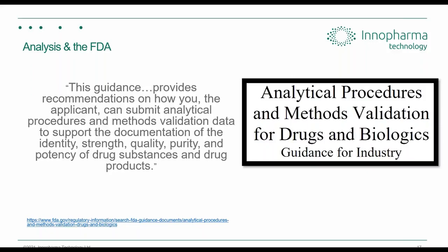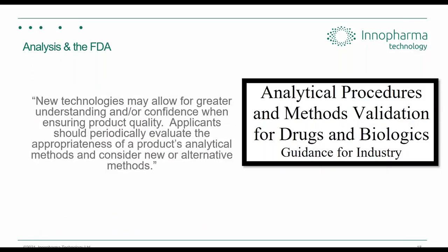Well, maybe over the life cycle of a product, new information and assessments might become available. You know, like Sieve's been around for centuries. New digital methods are coming into vogue. They're inline to real time, for example. So you might get better understanding of your CQAs and what's happening in your process by bringing them in. But this may warrant then the development and the validation of a new alternative analytical method. And that's what this document really highlights. So there's just a statement here talking about really new technologies that's mentioned in this document. But essentially under alternative analytical procedures, the data that you generate could be used as part of an analytical method comparability study.